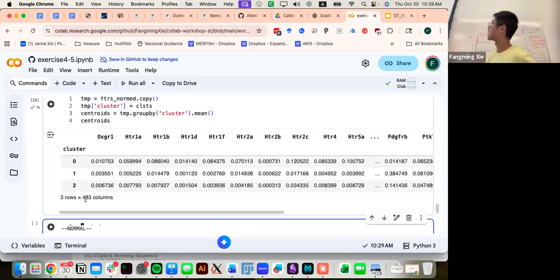Just by scanning through the numbers, you no longer see zeros. Initially, you see a lot of zeros. Now you don't see any zeros. That is just because initially a lot of cells don't get transcripts being detected inside. But if you group lots and lots of cells together, any gene will have some expression on average, right? So that's a way of reducing noise, or combating what was it, dropout rate, in capture efficiency, and all of that.